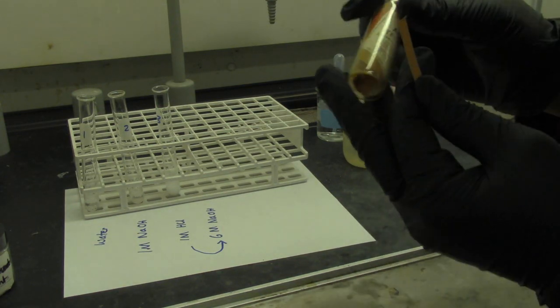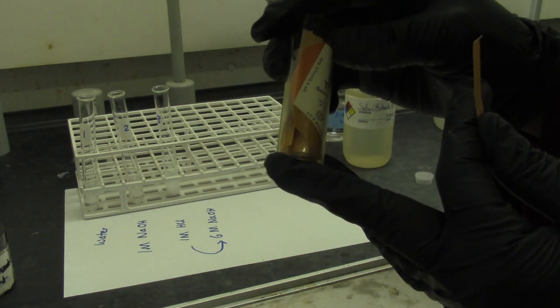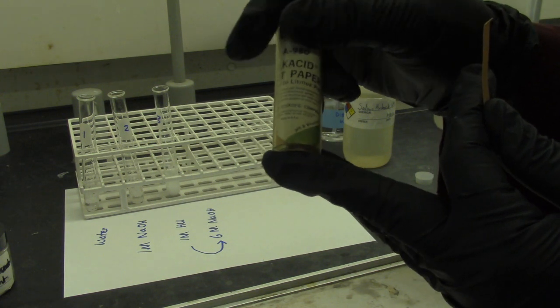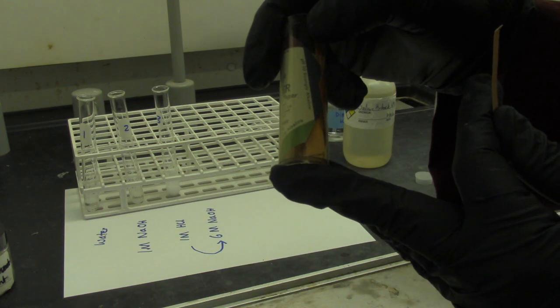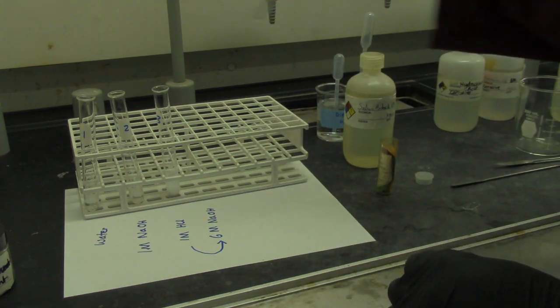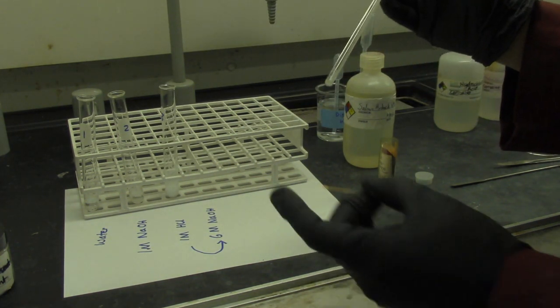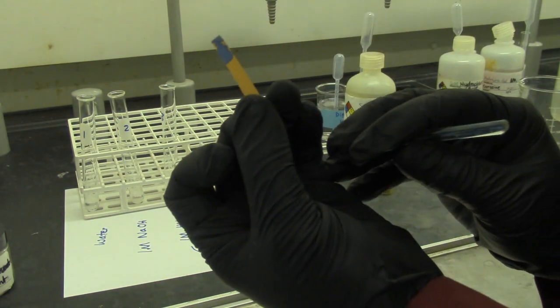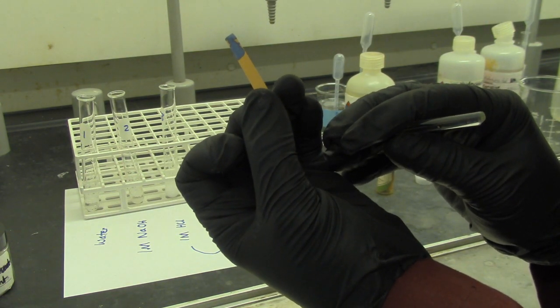I forgot to mention, this is a litmus paper. If you see red, that means it's strongly acidic. If it's weakly alkaline or basic, it will be bluish. Take a dip. Take down the observation, acidic or basic.